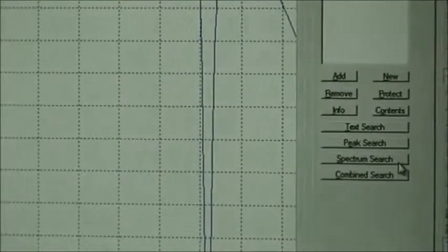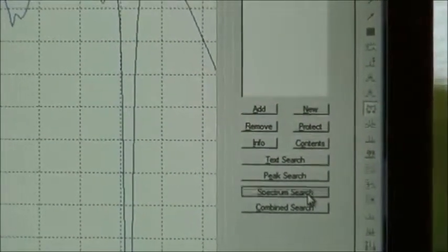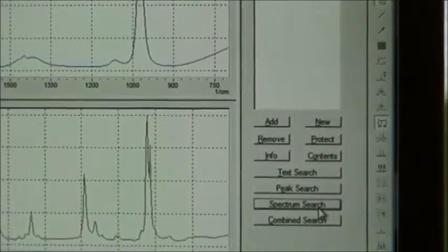And then I'm going to come down to spectrum search. I wanted to check my whole search, the entire spectrum. So I search. And let's see what did it come back.